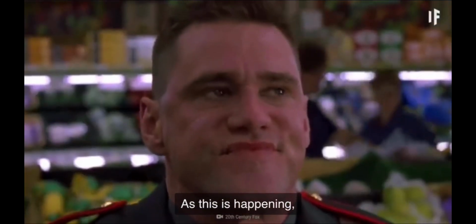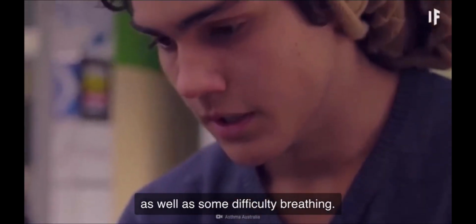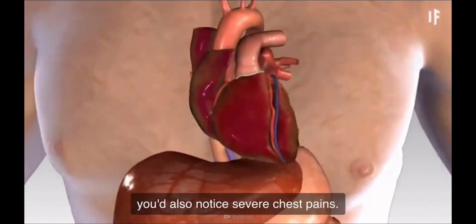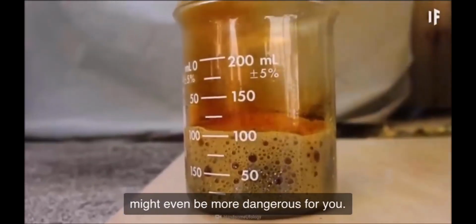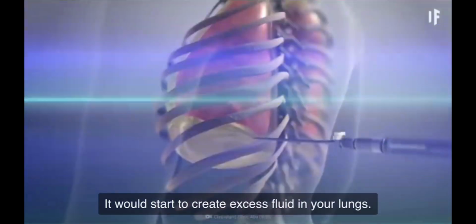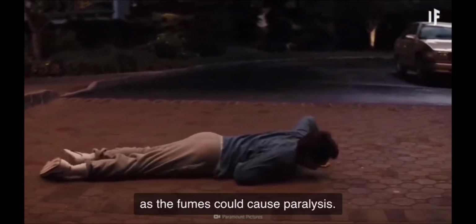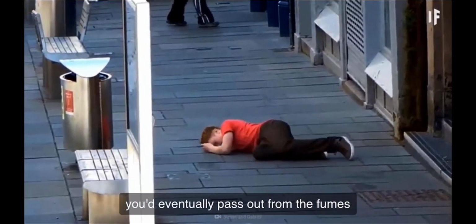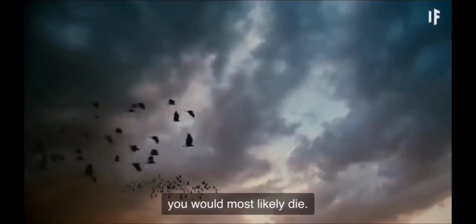As this is happening, you'd also notice some throat irritation, as well as some difficulty breathing. In addition to all this, you'd also notice severe chest pains. And the fumes that it produces might even be more dangerous for you. It would start to create excess fluid in your lungs, and you might not even be able to move, as the fumes could cause paralysis. If you couldn't move, you'd eventually pass out from the fumes and the difficulty breathing. Unless you got immediate medical attention, you would most likely die.